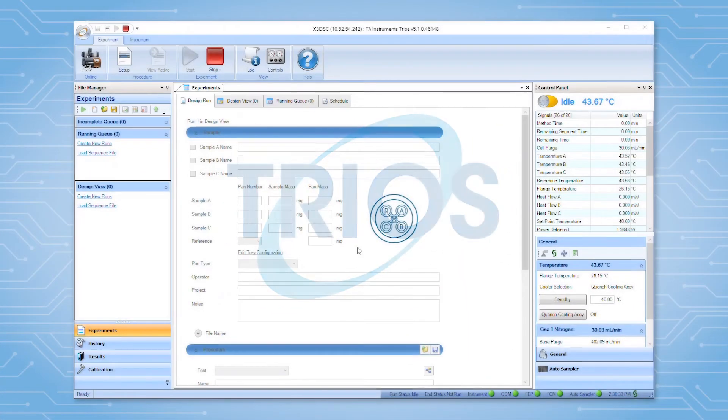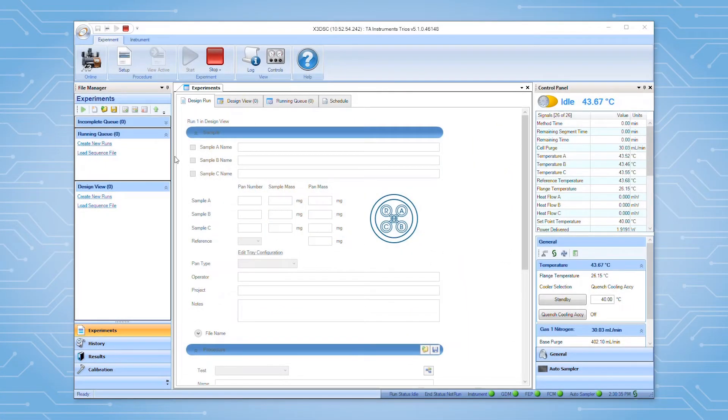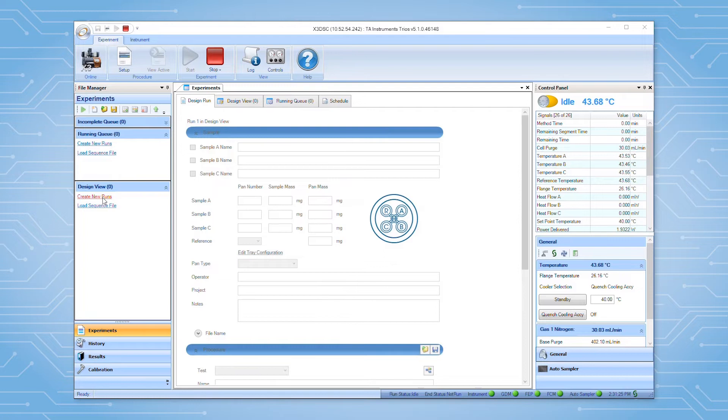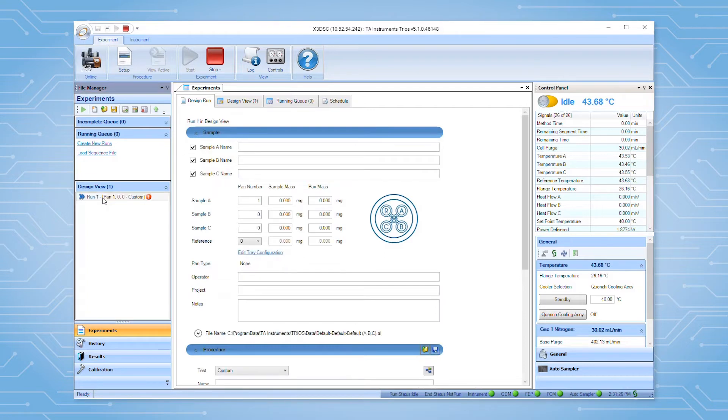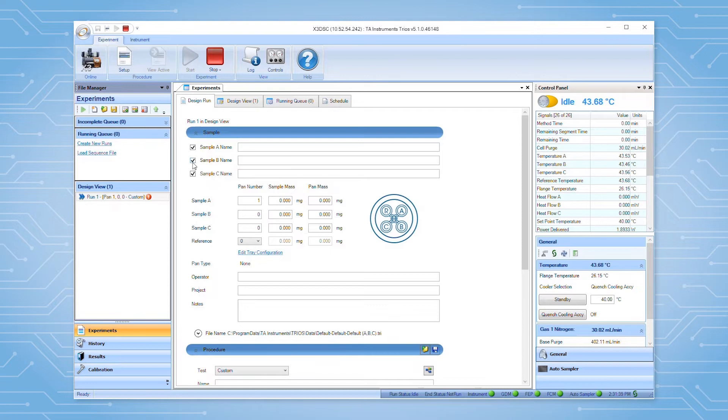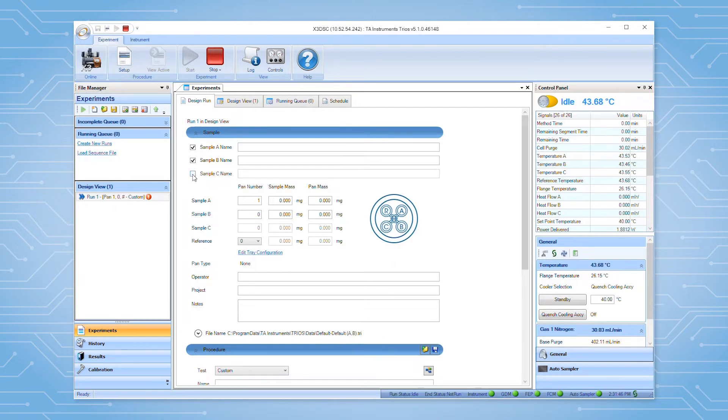Within TRIOS, you have the option to set up experiments in the running queue or design view sections of the file manager. To start, select the create new links to create a new empty test. All three sample sensors are enabled by default. If only one or two samples are going to be run, simply uncheck the box next to the sample sensors that will not be used.